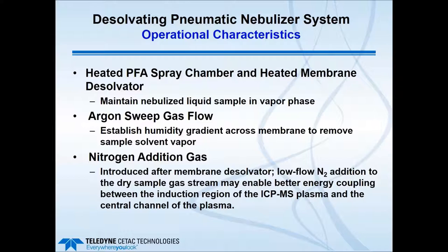So, some more details on the operational characteristics of the system. As we've mentioned, the heated PFA spray chamber and the heated membrane desolvator are there to maintain the nebulized liquid sample in a vapor phase. The argon sweep gas flow essentially establishes a humidity gradient across the membrane. So the argon sweep gas that's coming in and is flowing around the outside of the membrane is very dry. So that humidity gradient helps force the sample vapor to move across the membrane and then go to the exhaust and be taken away and is no longer part of the sample stream that's heading towards the ICP-MS.